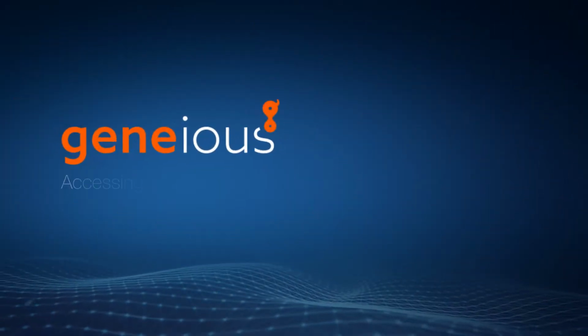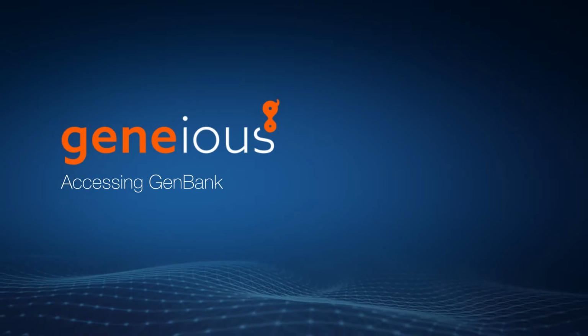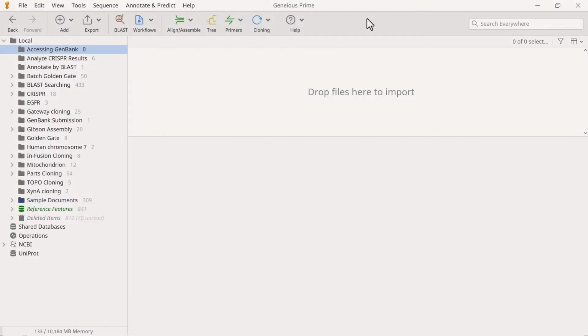Welcome to this video on accessing GenBank with Geneious Prime. The GenBank database is built and distributed by the National Centre for Biotechnology Information, otherwise known as NCBI. This comprehensive database contains publicly available nucleotide sequences and protein translations.